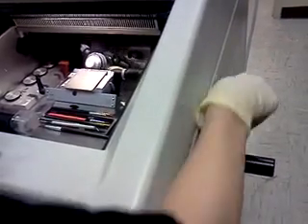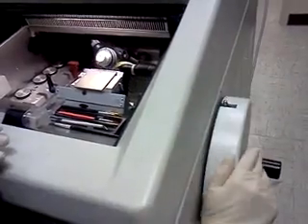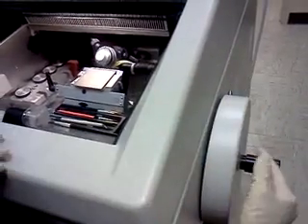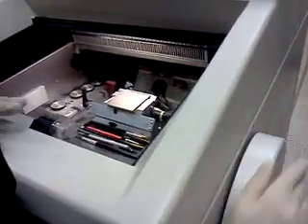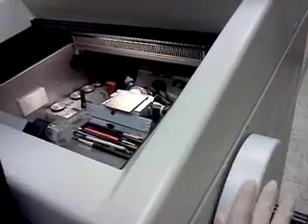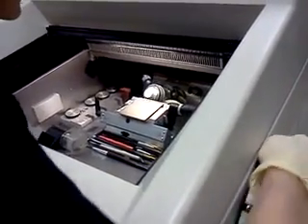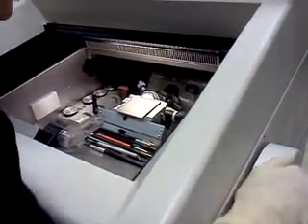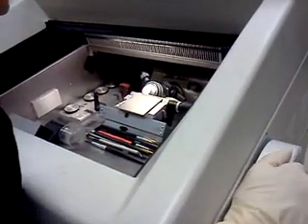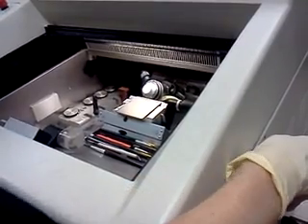Okay, so what we're going to have to do is just use this jerky movement that it is. It's going to be hard to make a good section today because, see, it has this thing that's continuous. Do you want me to do that for you? Unfortunately, no, you got to learn to do this yourself. So. Okay. We'll just have to do the best we can today. So you see, the farther back you are, the longer you're going to have to do this kind of thing. Maybe I can make this go for it.